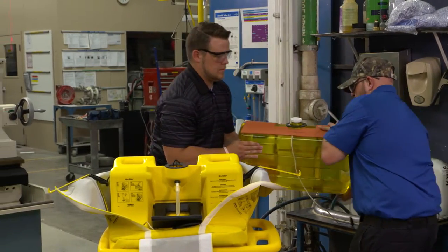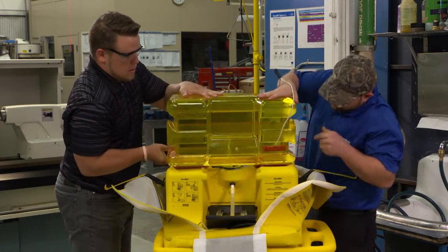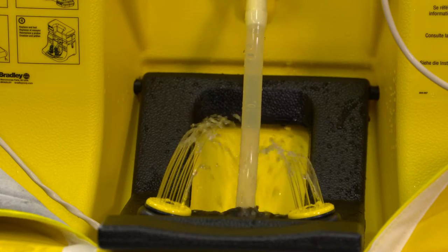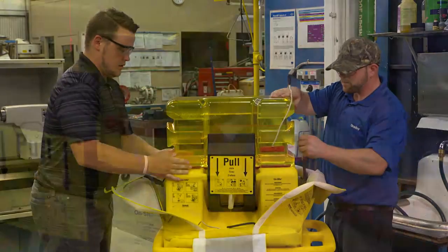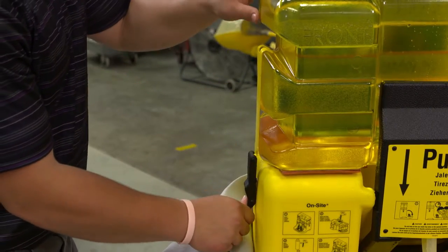Invert the tank and place it straight down on the pedestal to minimize spillage. A pierce on the pedestal will puncture a hole in the cap liner and allow the water to flow. Minor spillage may occur. Secure the tank to the pedestal using the side clamps, and make sure the latches are pulled down tight.